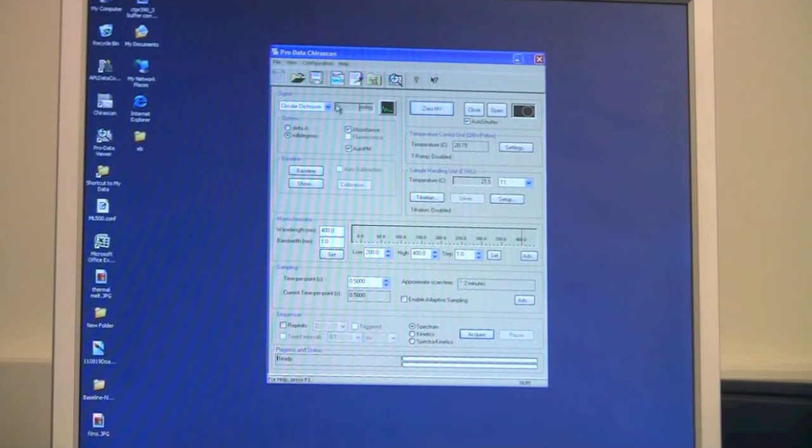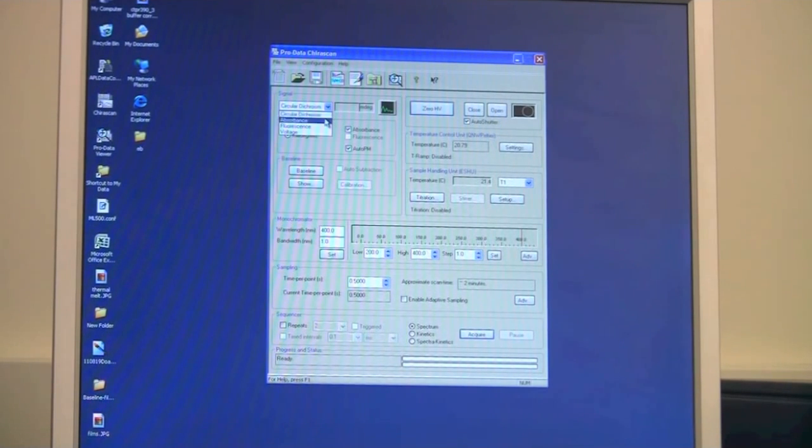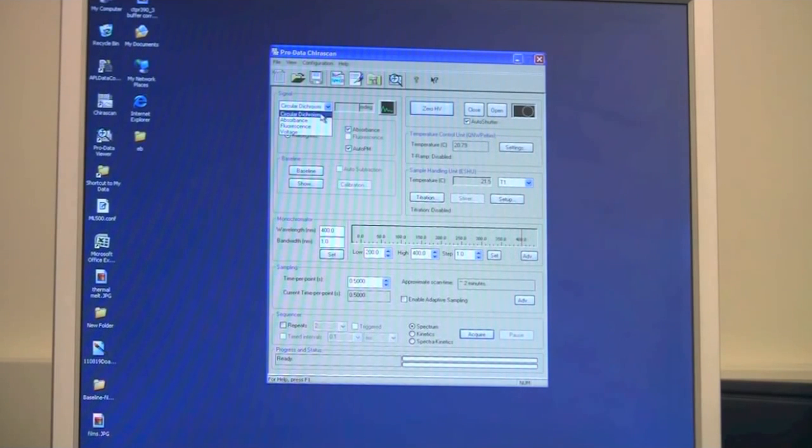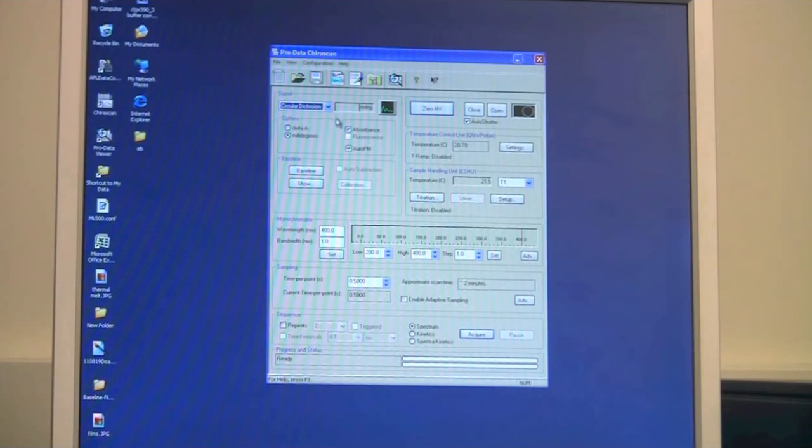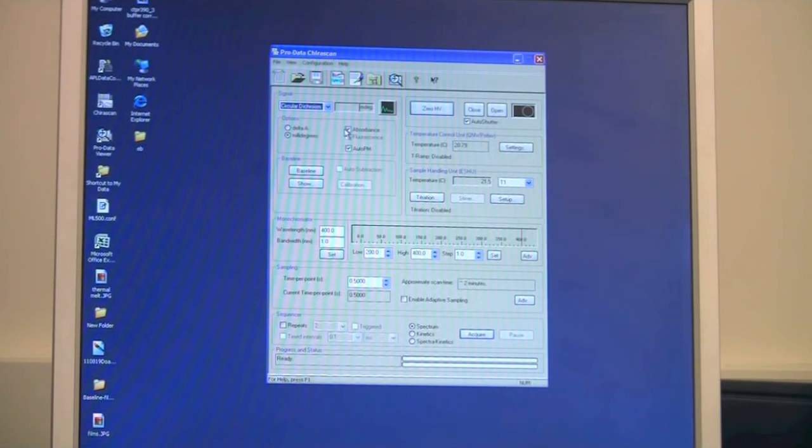In the top left corner there is an option of choosing what kind of signal you are looking at. CD signal, absorbance, fluorescence or voltage. You have the option of choosing to measure absorbance simultaneously with CD.